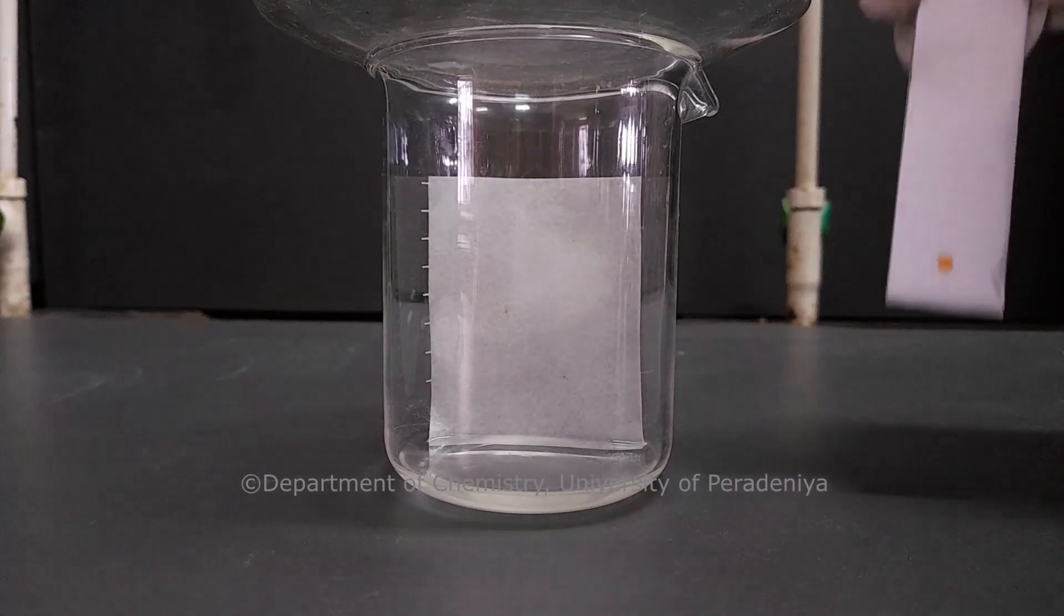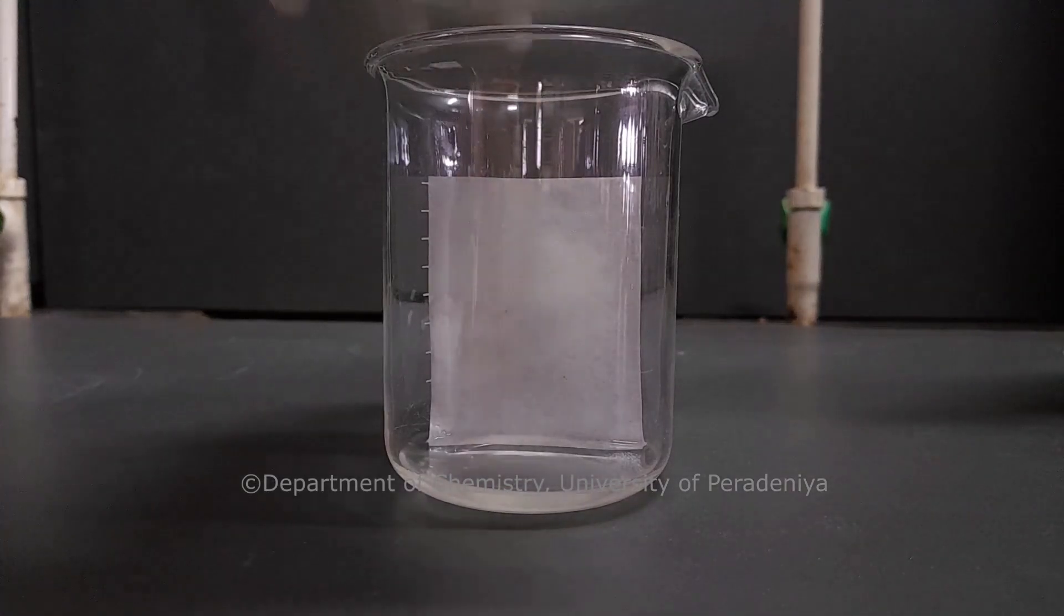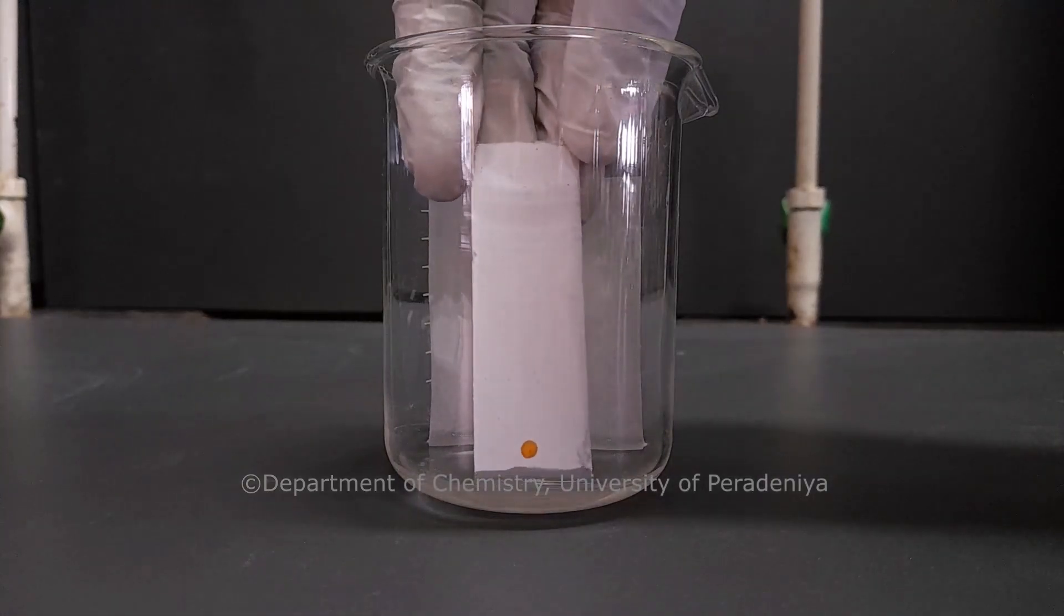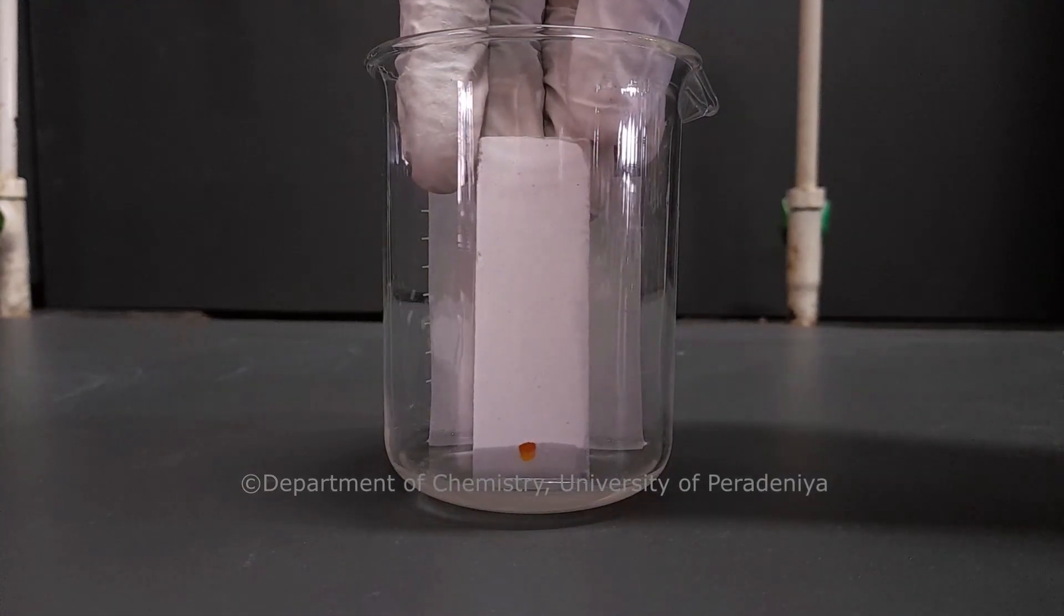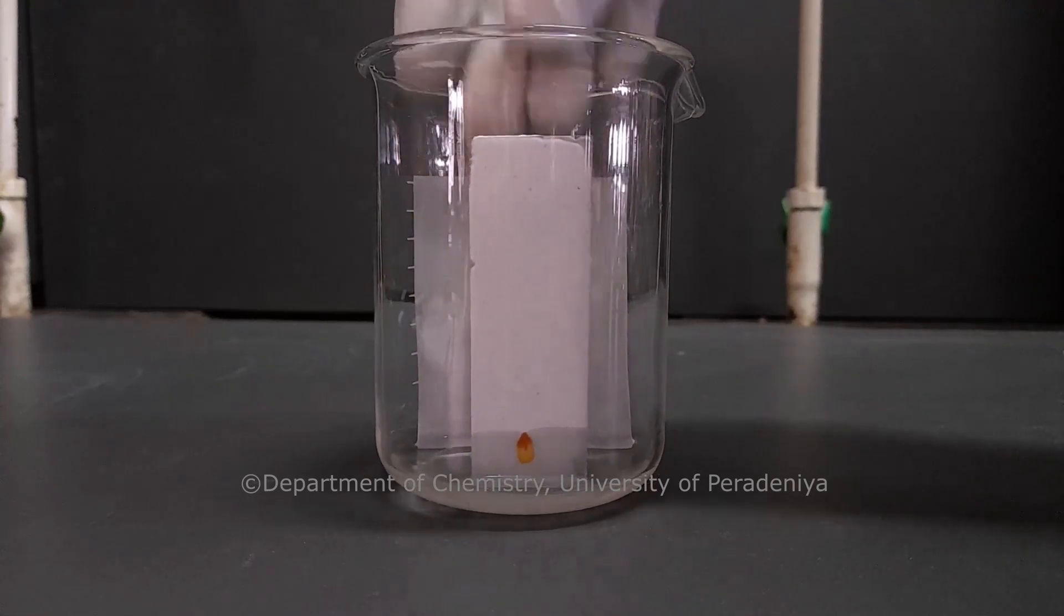Then the plate is kept inside the chamber. Make sure the solvent is there and the solvent height is lower than the baseline of the TLC plate. Otherwise, the compounds will dissolve in the pool of solvent instead of traveling up the plate.